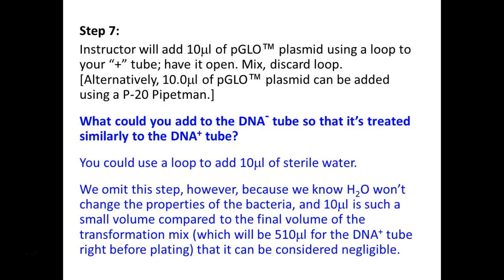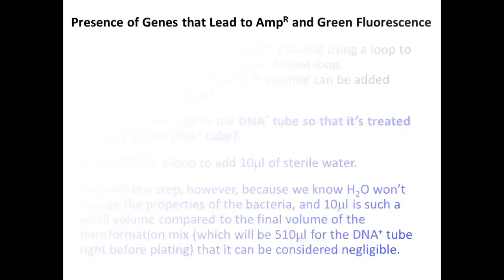So our negative tubes are going to be short a volume of 10 microliters. It's not the end of the world.